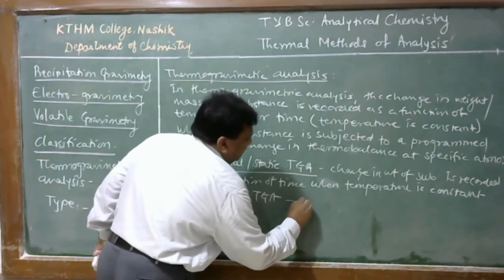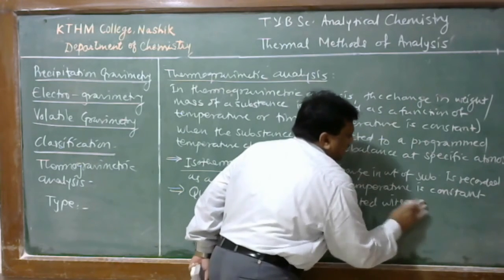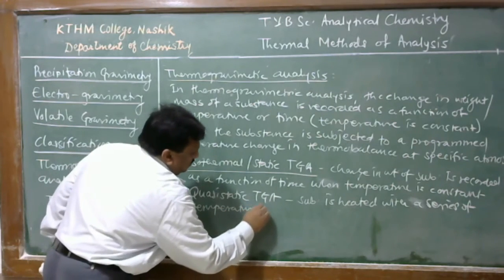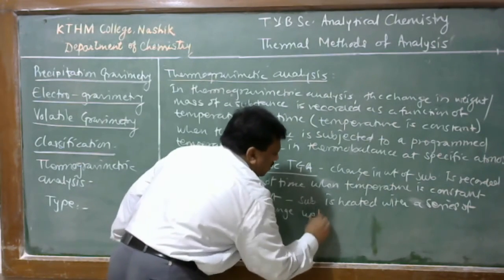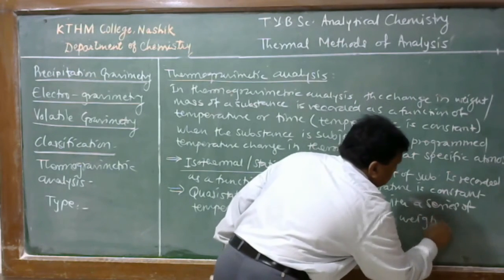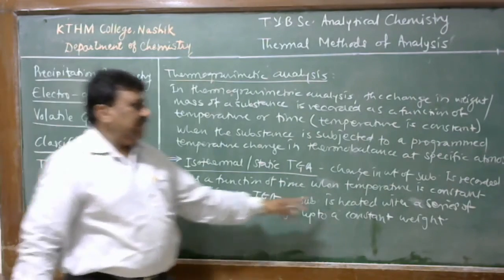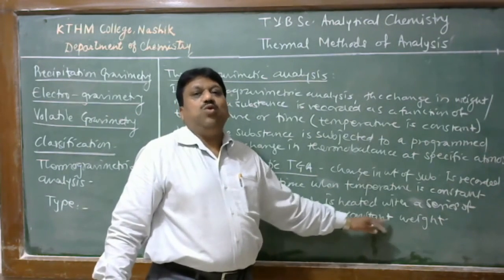In this case, the substance is heated with a series of temperature ranges in order to bring the substance to a constant weight.